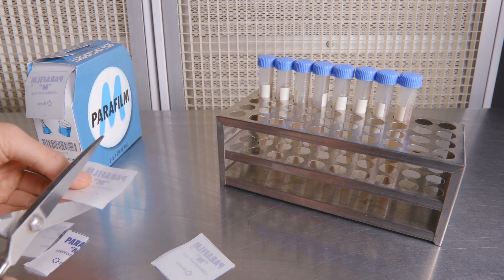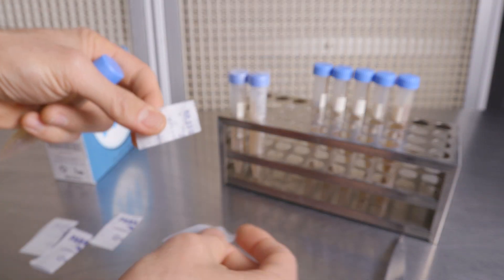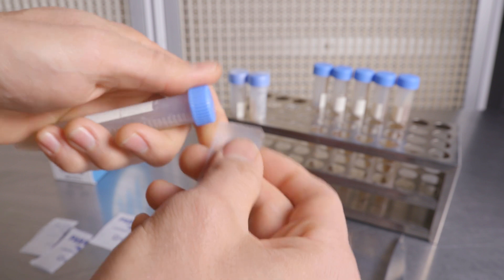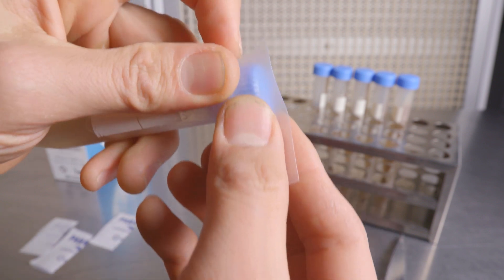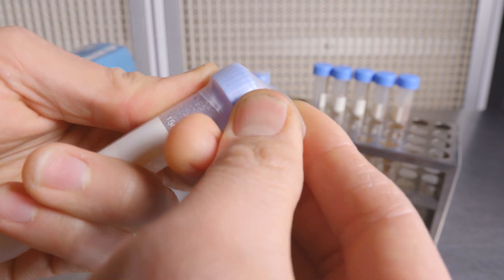If you are using parafilm, just simply cut a square and cut that square into half. And then you'll take the piece of parafilm and just stretch it over the cap. Be sure that you're wrapping underneath the cap as well as over the cap. That way you have an airtight seal.